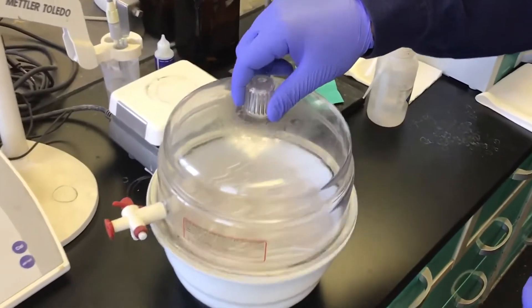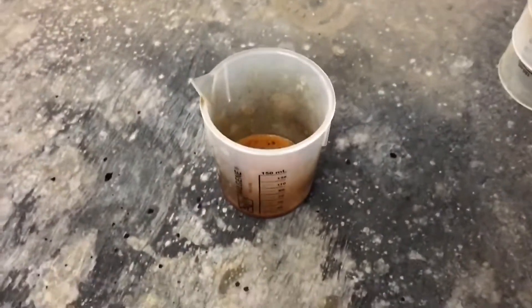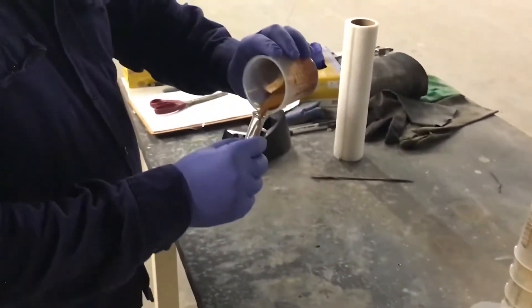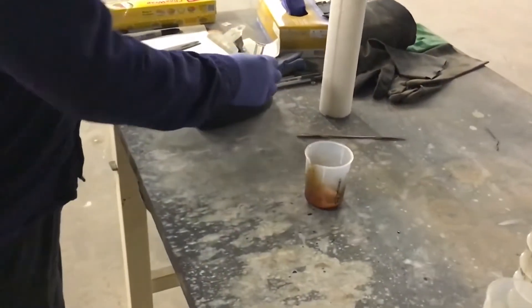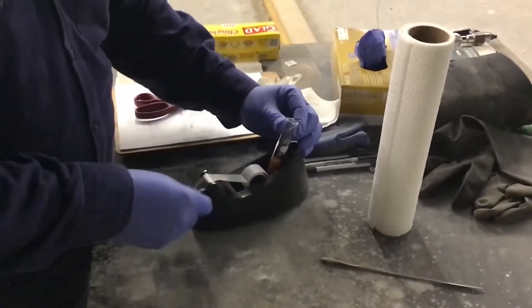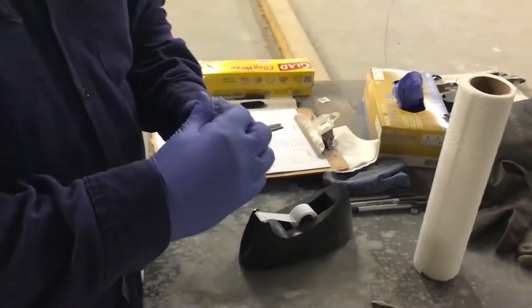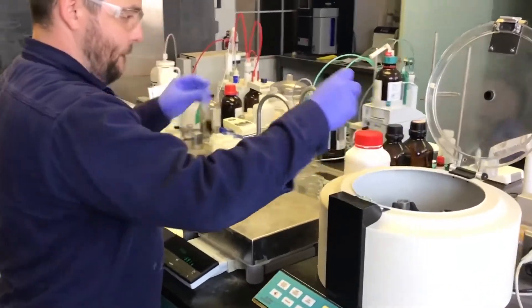We start by taking a clean centrifuge tube from our storage container that has desiccant in the bottom to keep the tubes dry. Acid sampled from the unit may still have entrained isobutane, and it is recommended that you allow the sample to degas prior to transfer into the centrifuge tube. A few milliliters of acid is all that you need per sample. We use a small piece of saran wrap placed over the opening of the tube and scotch tape to reduce exposure to the atmosphere — this is especially important if there's going to be a delay between the sampling and the titration analysis.